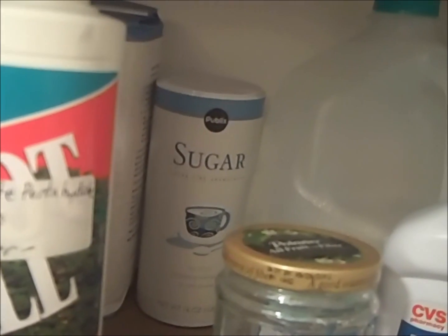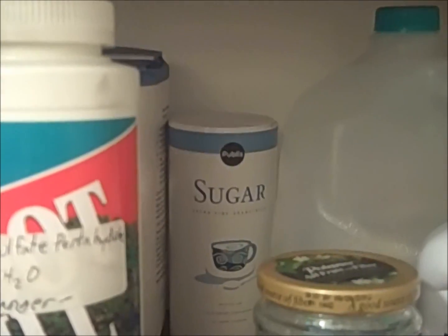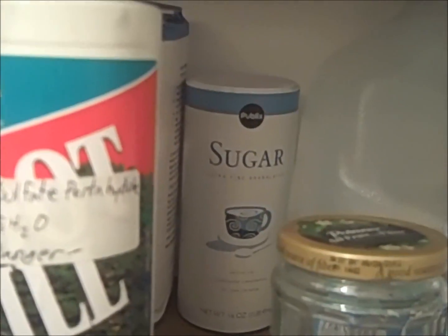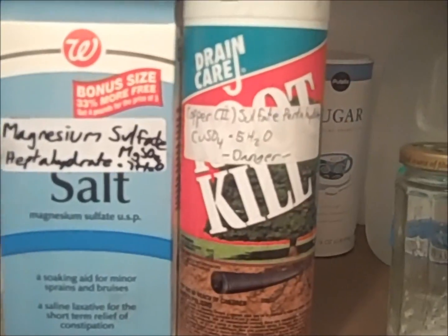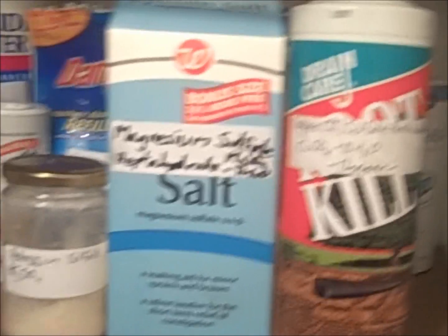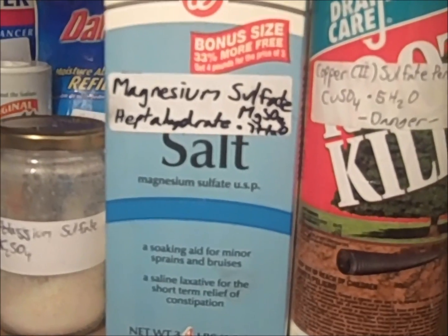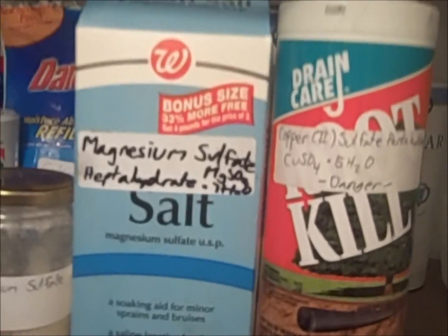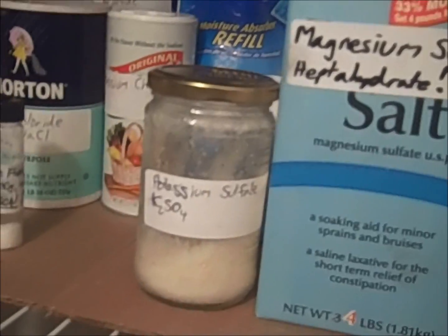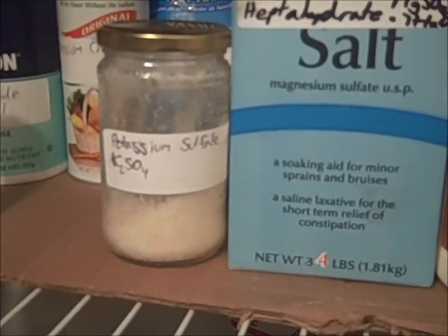In the back is sugar, which is just sucrose. The same stuff that is used for food can also be used for various chemistry experiments, such as dehydration through sulfuric acid. My sulfates include copper(II) sulfate pentahydrate, which is root kill — a drain product sold at Lowe's and Home Depot. Also, I have magnesium sulfate heptahydrate, which is magnesium sulfate with seven waters. This is sold at various pharmacies such as Walgreens and has various clinical uses. This is potassium sulfate, which I synthesized myself using potassium nitrate and some sulfate.